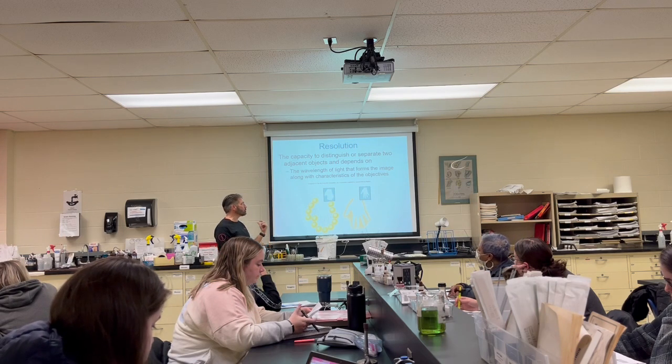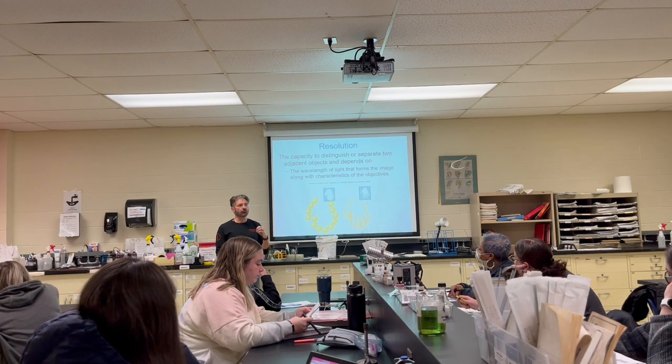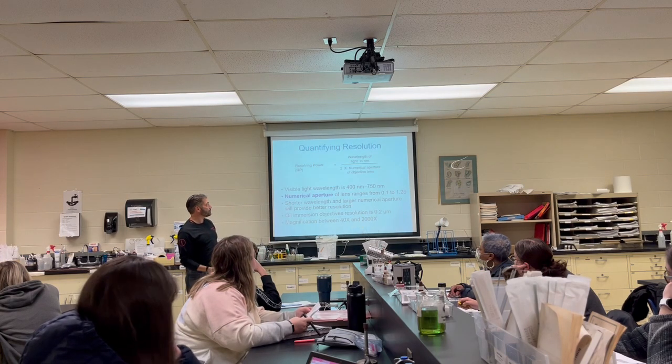When you get into oil immersion with bacteria, you want to be able to see the shape of the bacteria. Is it a cocci? Is it a rod? Gram positive or gram negative? And we'll go over that in lab. So don't panic about that.